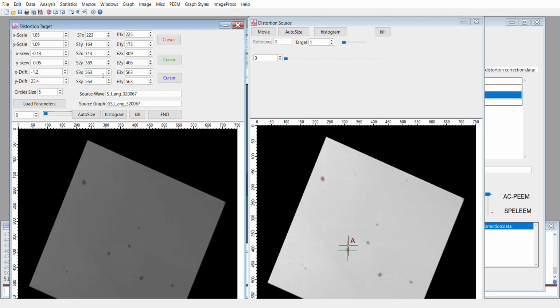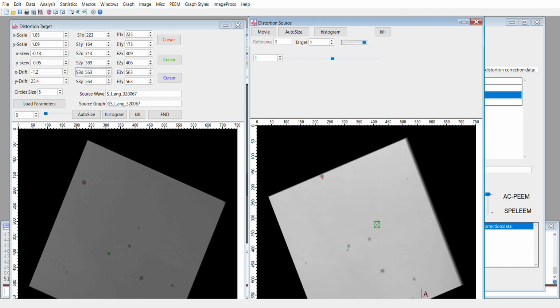Then we do the same with the third point. We click on the point 3 here, enter, then we go here, we activate the interface, and we move the dot to another point. We could probably use, let's use this one. The 3 points should be not aligned because they need to be independent. So okay, here, okay.